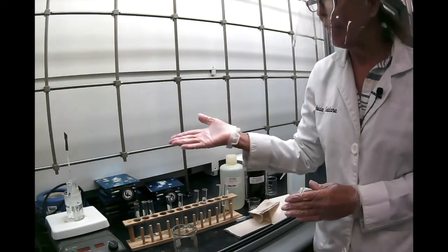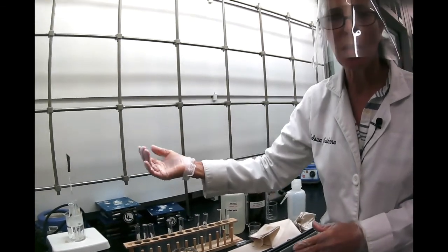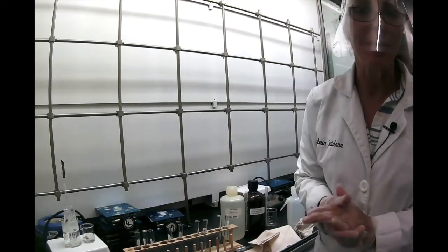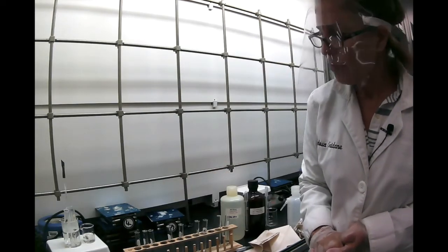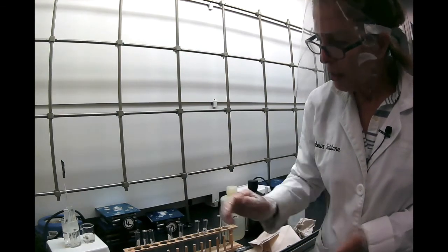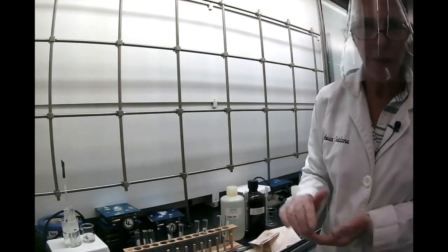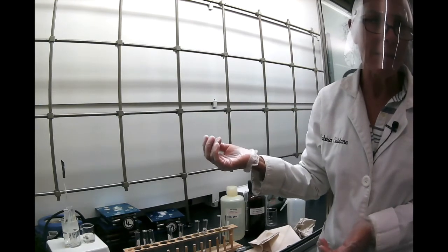One thing that can happen in the process here is that as you heat it, you might lose some of your water. So it's a good idea to have a little bit of hot water on the side to keep adding in case it evaporates. It takes a little patience to wait and see. The idea is to make sure you don't have too much water evaporating, so that you're consistent with your observation. For every sample, you have about the same amount of the sample and about the same amount of the water.